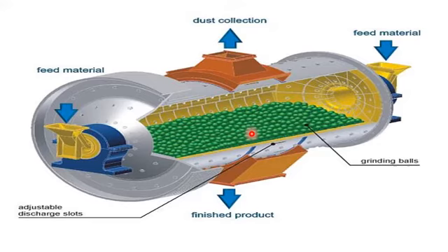Okay, so it is based on a top-down approach, or in simple words, this method is also known as mechanosynthesis or the top-down process. So high energy mechanosynthesis or the high energy ball milling process is the name of this method, which is commonly used especially for preparation of nanomaterials in nanotechnology.